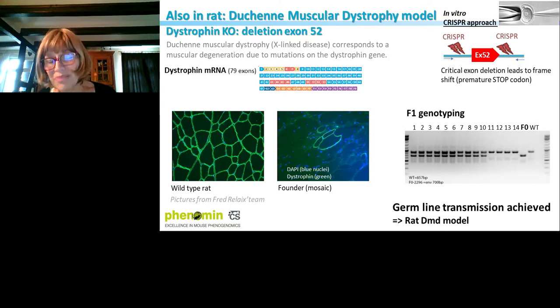And here is the genotyping that we performed. Under the F0, it's the males that we genotyped first. Then you could see only one allele. Then it looked almost homozygous. And the animals numbered 1 to 14 are the F1. And you can see that all the females had the deletion, which shows that it's really efficient. And this line is still not published, but it's definitely the first Duchenne muscular dystrophy model in rat, and will be certainly really valuable to study the model more in depth.